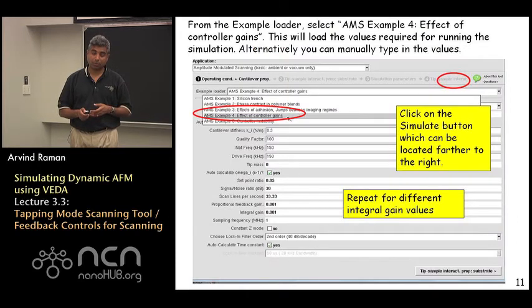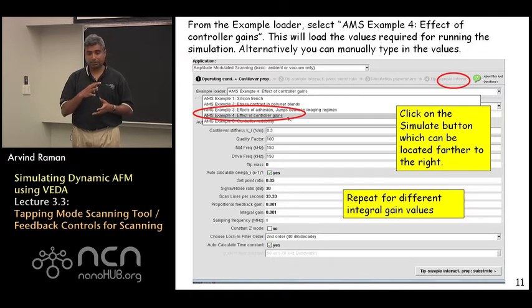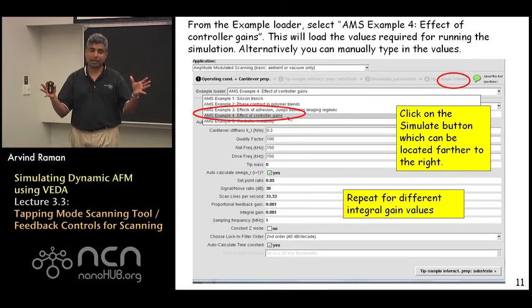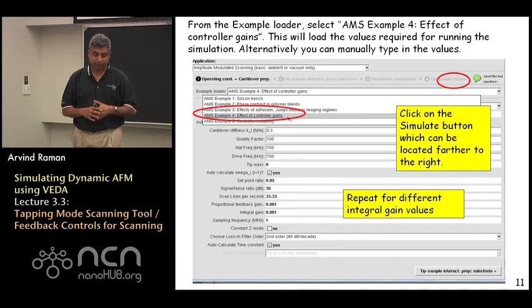So in order to do this one goes through AMS example four. It is a preloaded example that you can do and all these parameters for the feature and substrate are already in there.